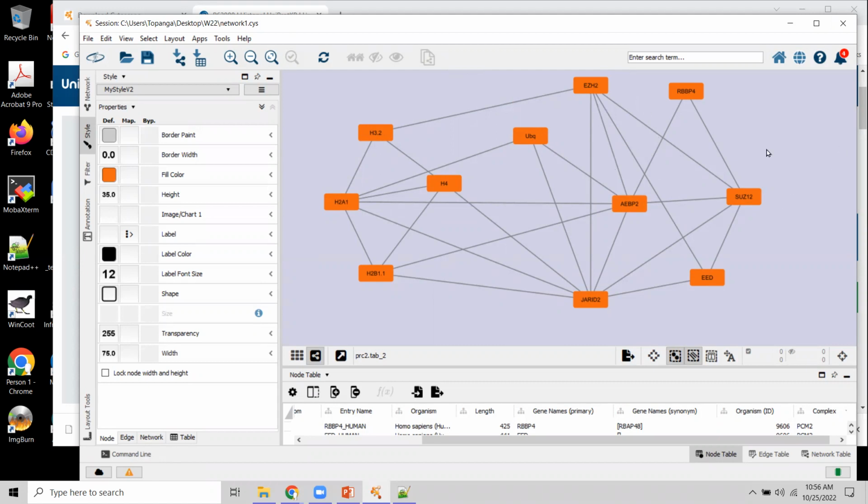In our case, it's simple to select things by using a marquee to get all the complex because things are arranged in a way that is easy. Not always the case.